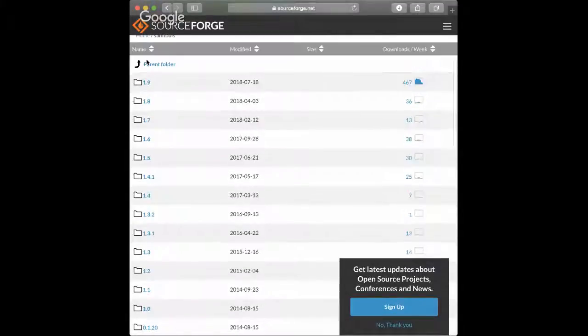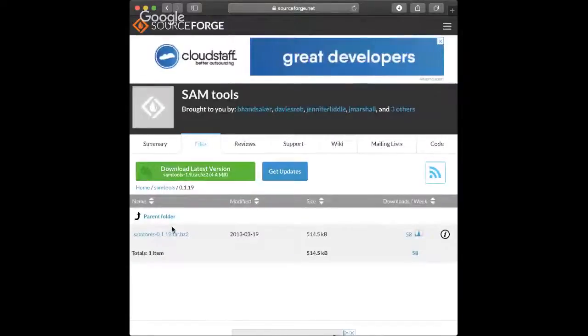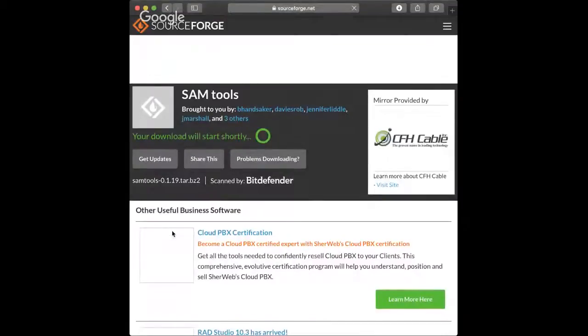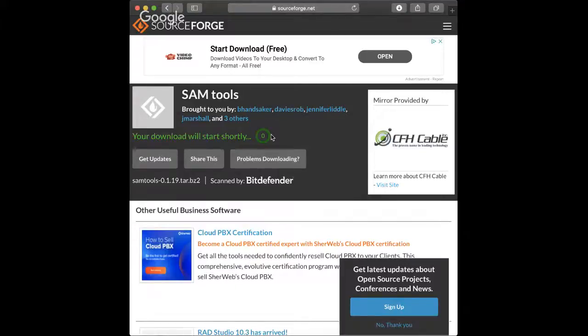Like I said, the most recent version is 1.9, but I just kept getting a fatal error message and I didn't want to have to deal with it. So this version is also compatible with the protocol. You just have to add in an extra line in your script, which I will go over when we get there.